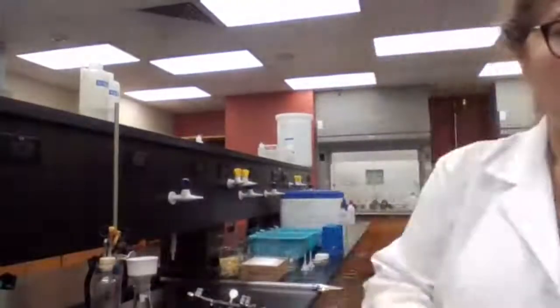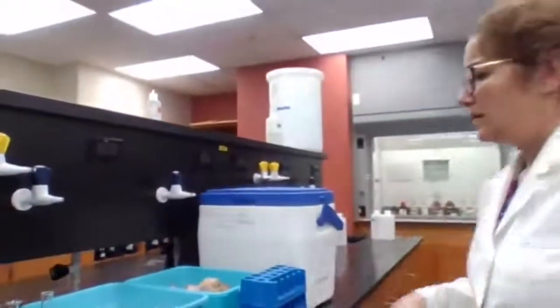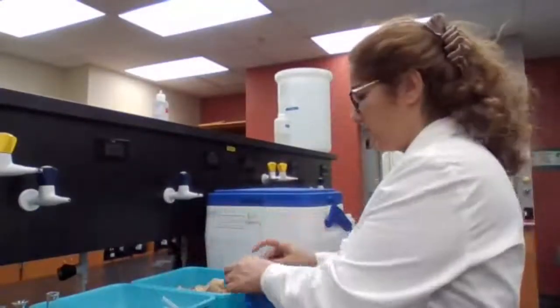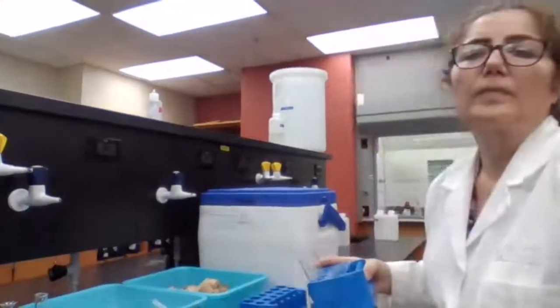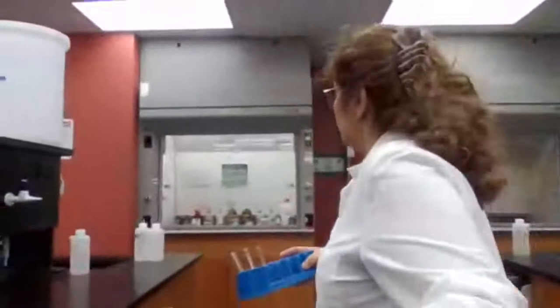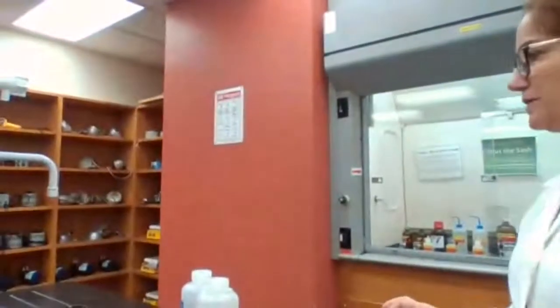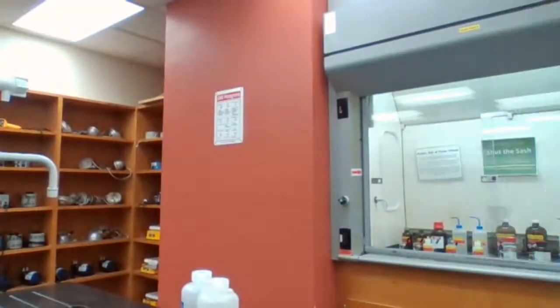So I need your help to tell me which solvent should I use for my solubility test. Which solvent? What should I use for solubility test? I'm going to do the experiment. I'm going to grab my safety glasses.